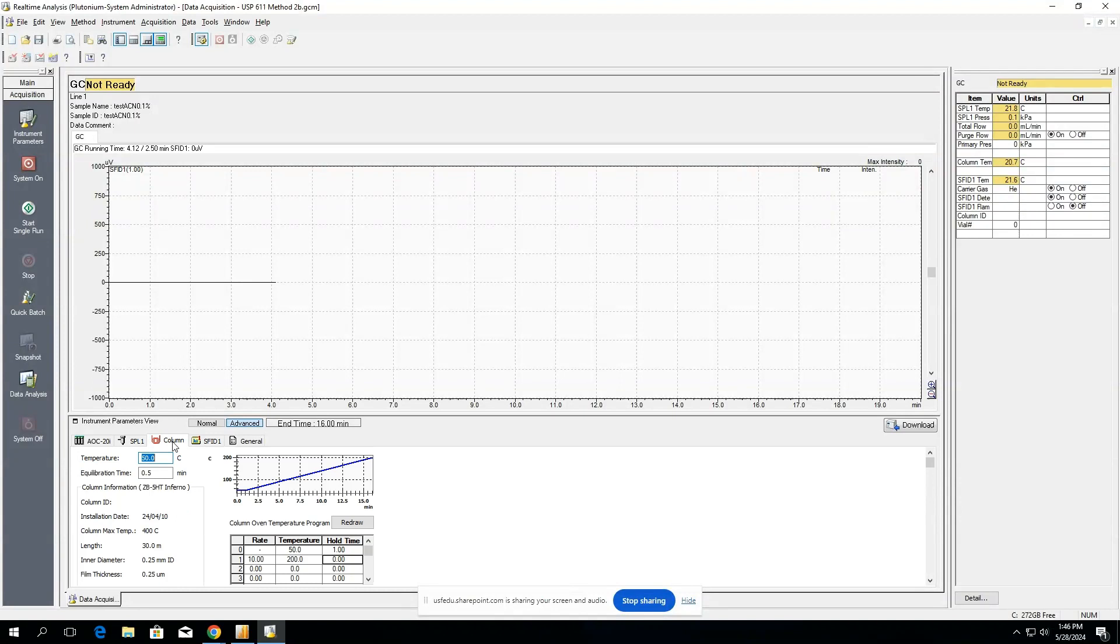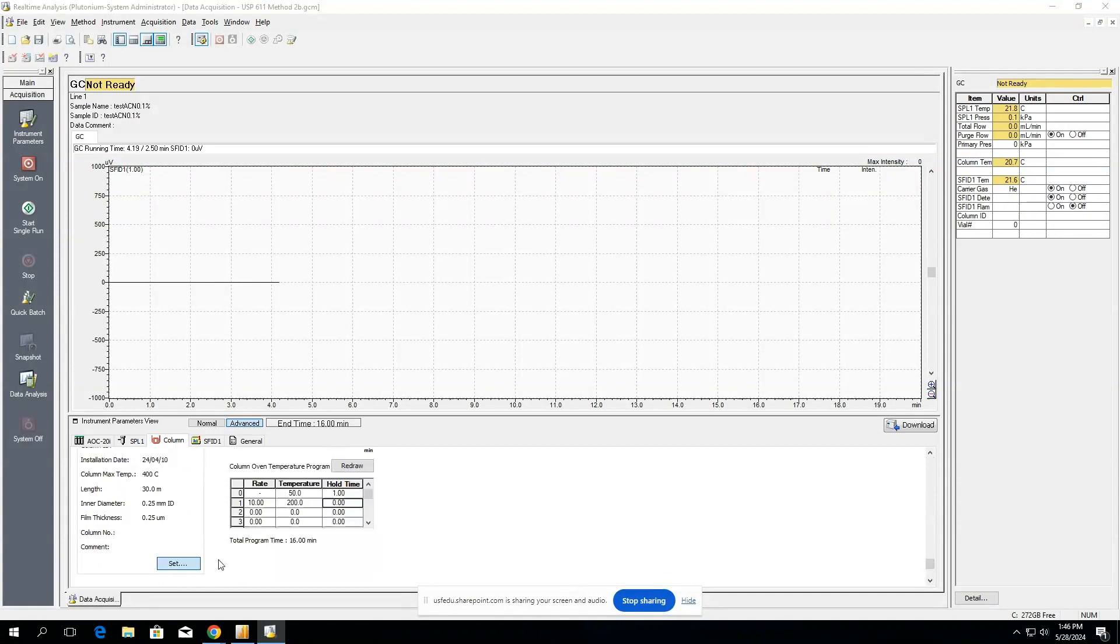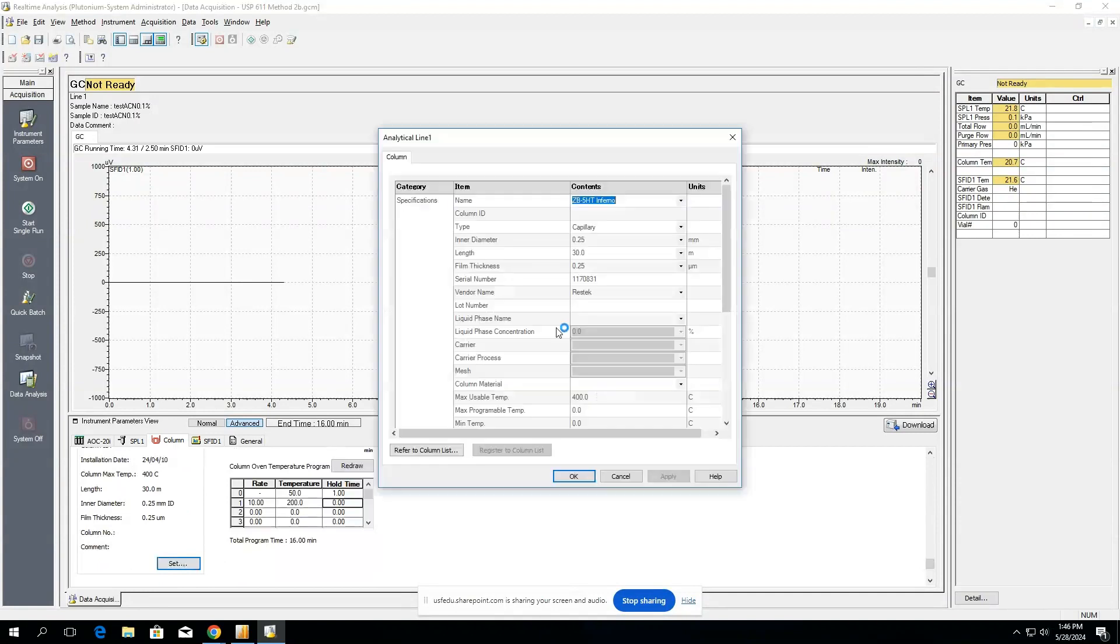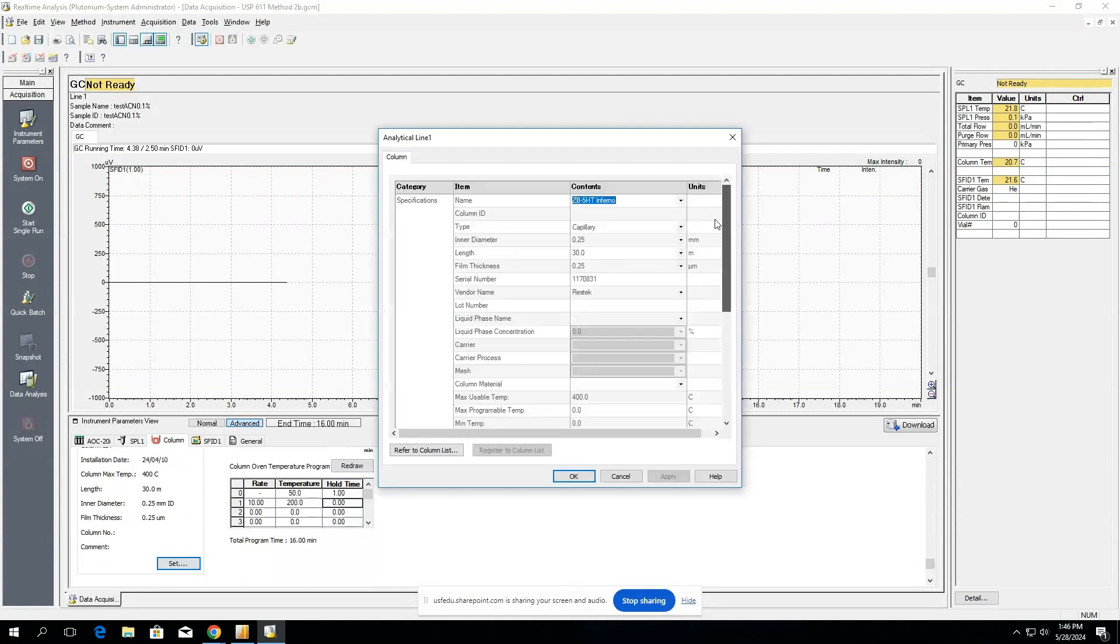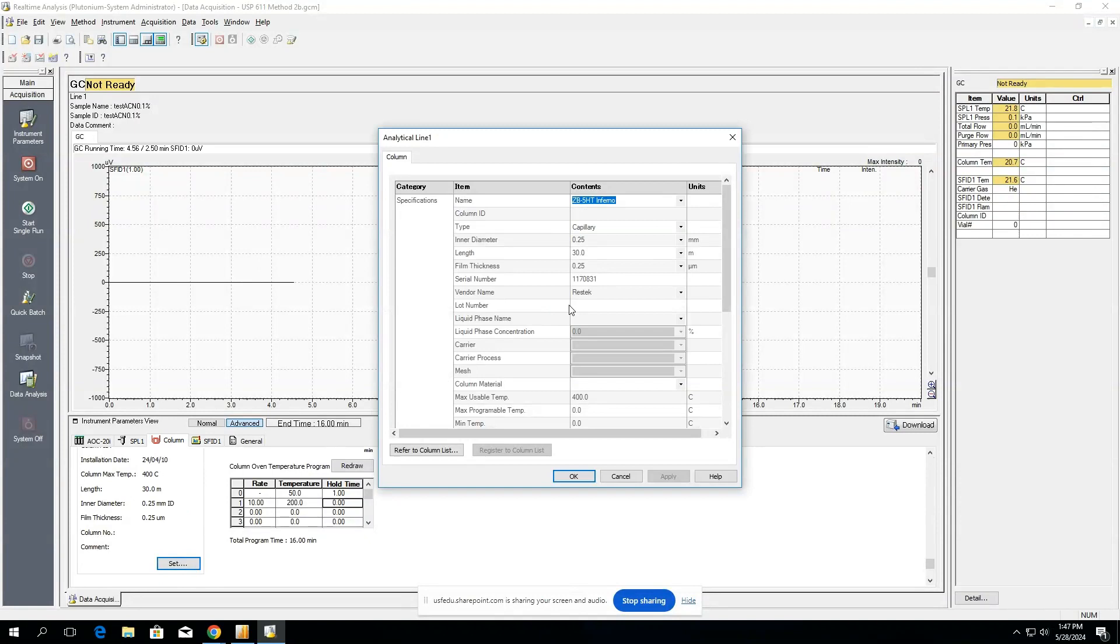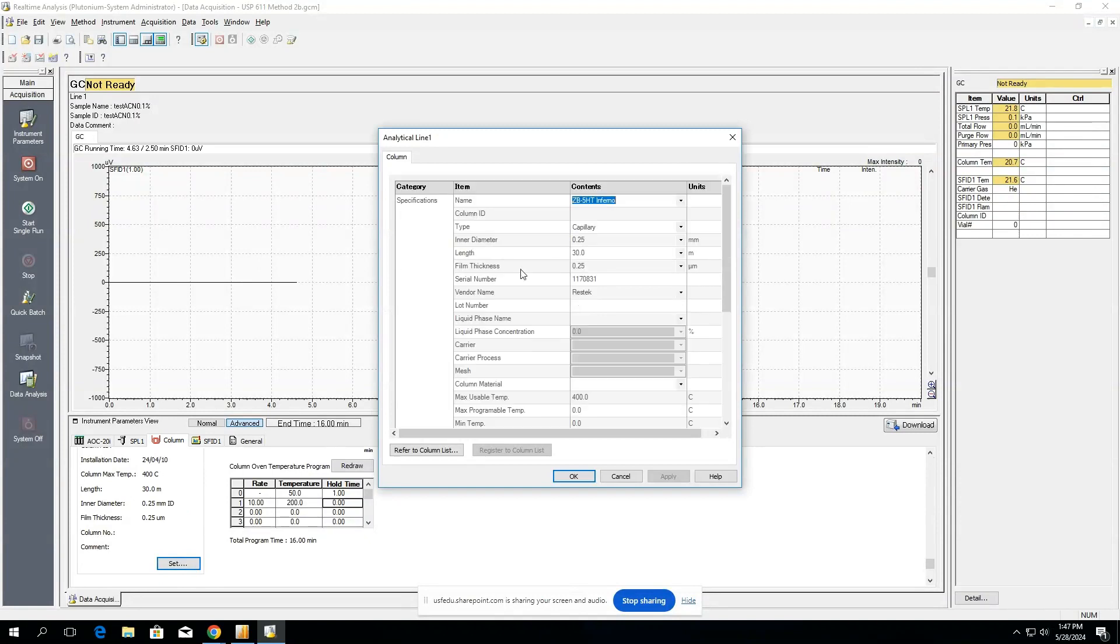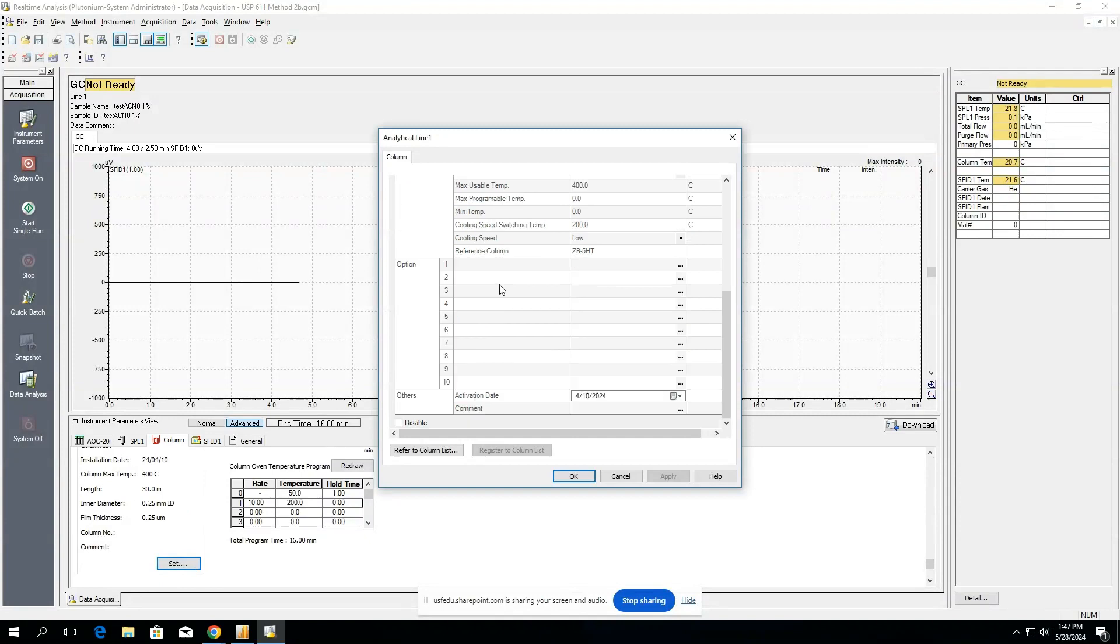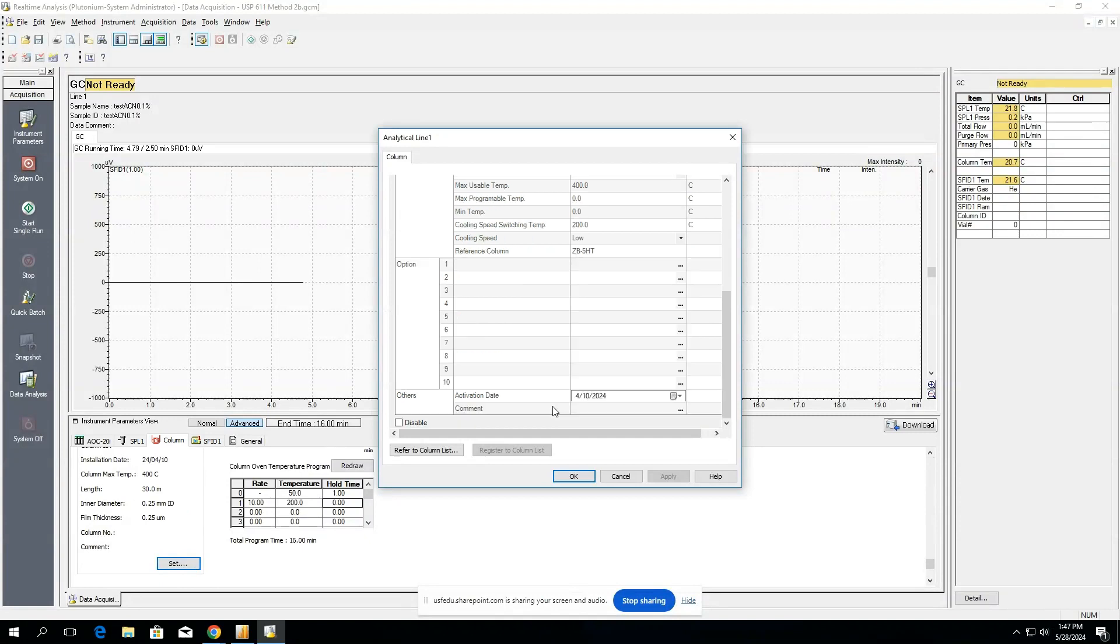Let's say you're changing your column. You want to make sure to set your column parameters in here in the set option. So you'll select set, and then you want to make sure that all of these parameters match everything that your column has. And if you look at the box that your column comes in, all of this should be inside of the label, if not on any documentation that comes with your column. Try and fill out as much of this as possible, although the vital information is typically the inner diameter, the length, the film thickness, as well as the max and minimum temperatures and the activation date.